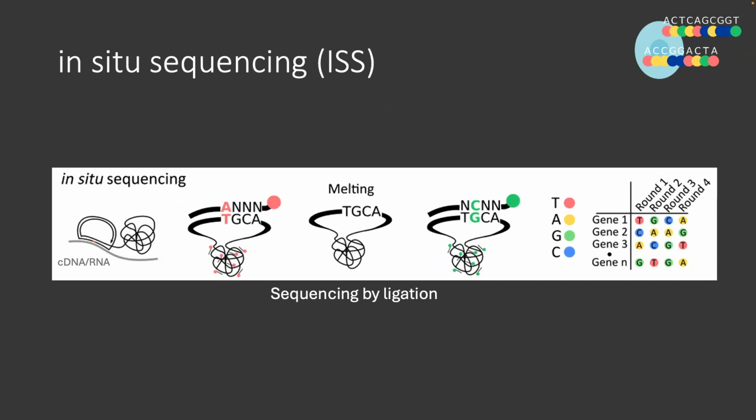So you have all your copies, then there is either a barcode sequence that you put into your padlock probe, or this could be the gap-filled portion here. So this could be the sequence of your RNA. And then the method uses ligation, so it hybridizes these probes with one determined nucleotide and then random nucleotides here.